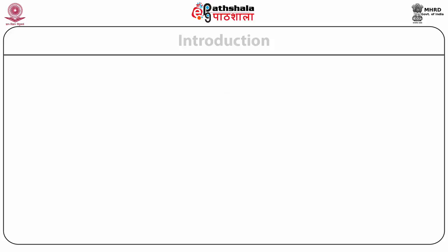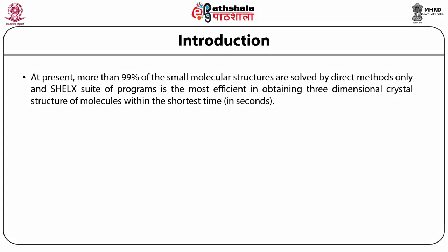At present, nearly 8 lakh small molecule structures have been determined, and more than 99% of these small molecule structures are solved by direct methods only, and Professors Hauptman and Karle have to be saluted for this success. And most of the people now use SHELX suite of programs written by Professor George Sheldrick from Germany. This is the most efficient package in obtaining three-dimensional crystal structures of molecules within the shortest time.